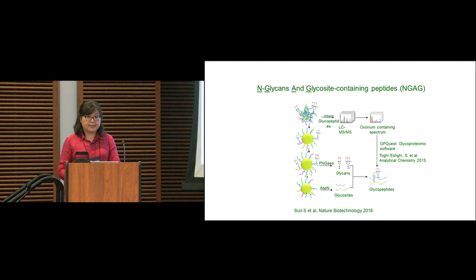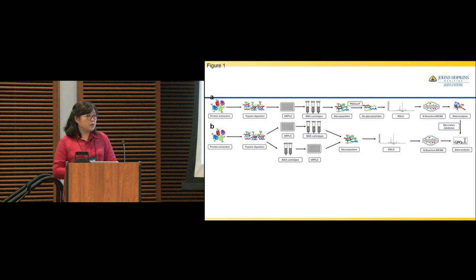So after we developed this initial approach, we tried to address a question from one of the projects funded by NSF: to determine the glycosylation of antibodies or glycoproteins expressed in CHO cells, which are commonly used for the production of glycoprotein drugs.